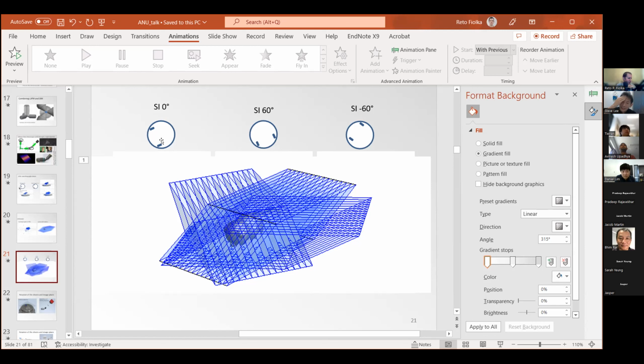The reason I asked that question was it might be quite interesting if that rotator could really, I wonder if. I know that the quantum optics guys would really hate this geometry because it bounces off the mirror at weird S and P angles. They normally want strictly S or P. So maybe a specially coated mirror could help, where you control a bit how S and P get depolarized, but yes, it's interesting that the device could potentially also be used as a polarization rotator.